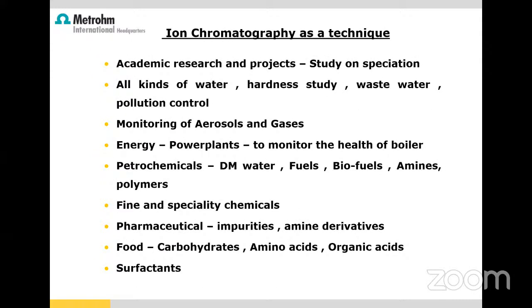So where is it used in many of the industries? So academic research and projects, they study speciation, they study all kinds of water, hardness study, wastewater, pollution control, etc. Then we can even monitor aerosols and gases, energy in power plants, whether it is thermal power plants or nuclear power plants, to monitor the health of the boiler, you have to monitor sodium, chloride, silica, hydrazine, morpholine, ammonium, etc. So that is possible.